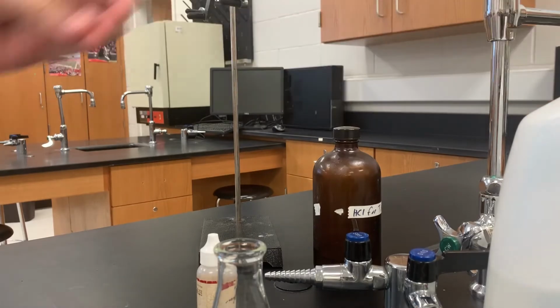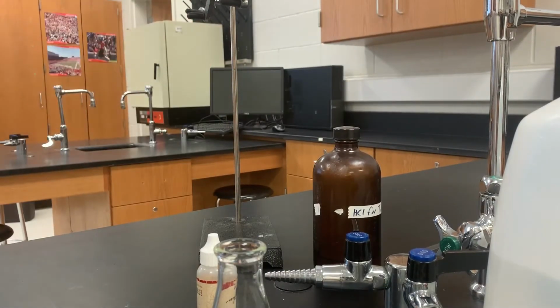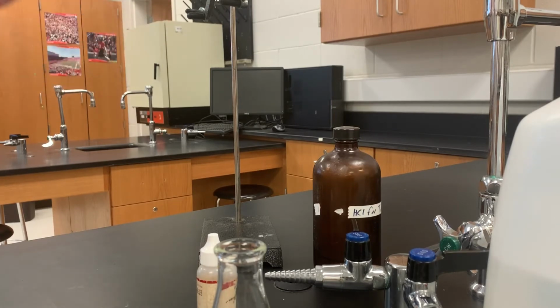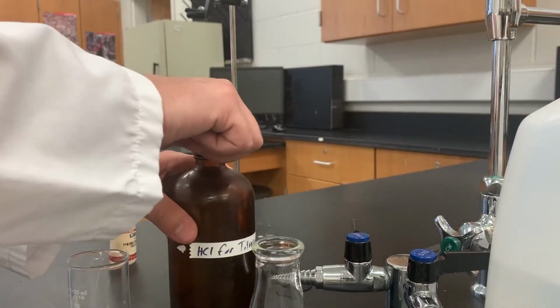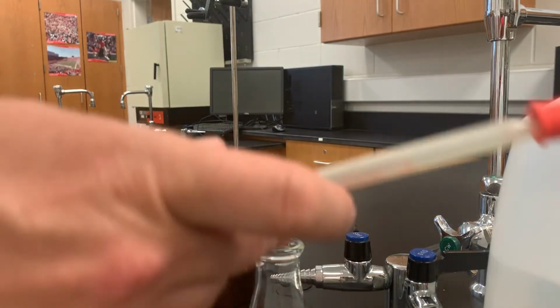I'm going to react a known volume of sodium hydroxide, whose molarity I know, with a volume of hydrochloric acid, whose molarity I don't know. In order to do that, I need to keep careful track of the volumes that I use. The first thing I'm going to do is, using this Erlenmeyer flask, transfer exactly 10 milliliters of hydrochloric acid into the flask.